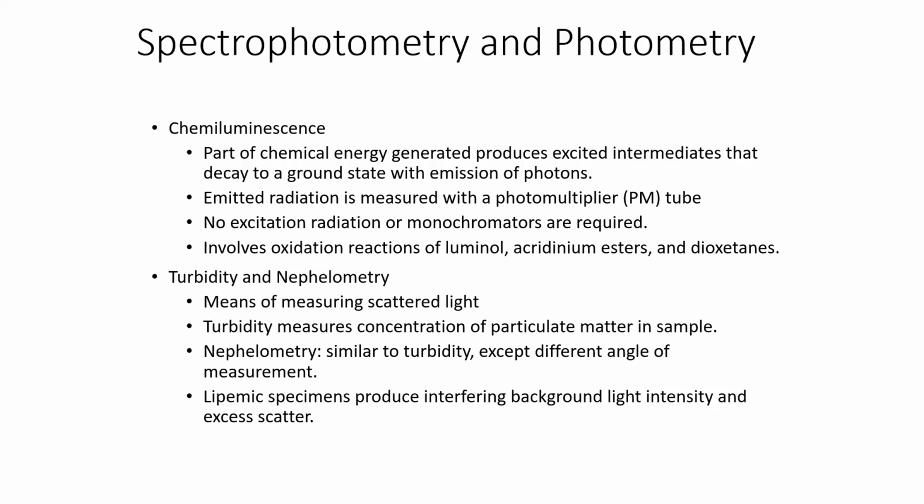Turbidity is also used in microbiology. So if we want to evaluate the number of organisms within a solution, we can grow up bacteria, and then we can see how turbid the solution is. We can also use turbidity measurements to dilute bacteria for certain assays.